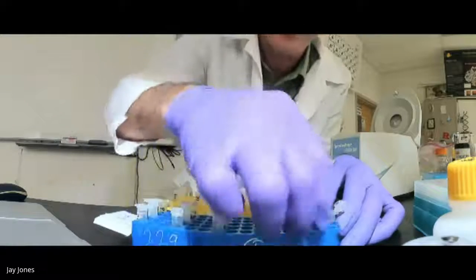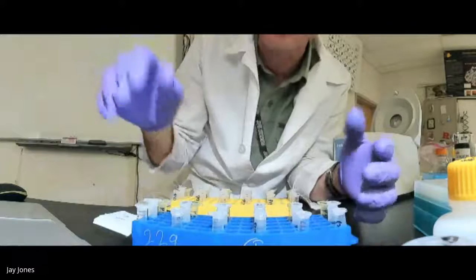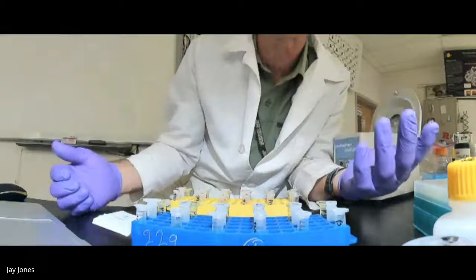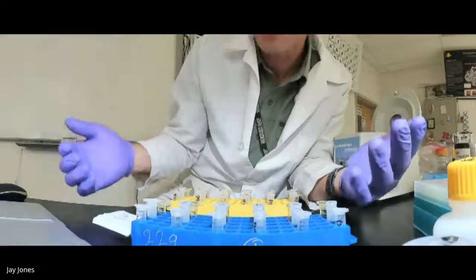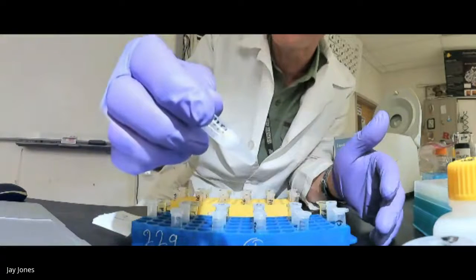And when you add H pluses, those carboxyls, it's really sulfates in this case, but it's the same idea, the carboxyls, the sulfates in the soap, they protonate. And if you protonate them, give them protons from the H pluses, then it doesn't work like a soap. There's no charged end. So now the soap doesn't work. Let's check. See the precipitate?